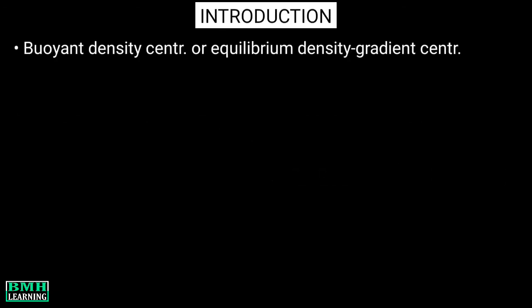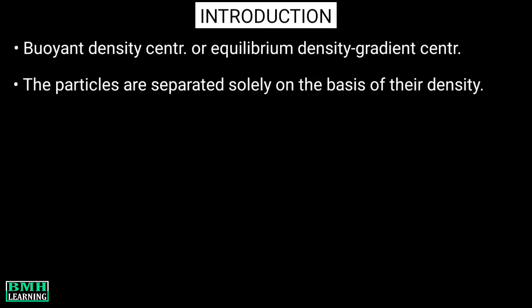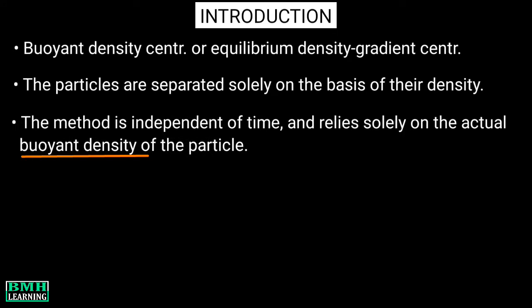This lecture is about isopicnic centrifugation, also called buoyant density centrifugation or equilibrium density gradient centrifugation. In isopicnic centrifugation, the particles are separated solely on the basis of their density. This method of separation is independent of time and relies solely on the actual buoyant density of the particle.